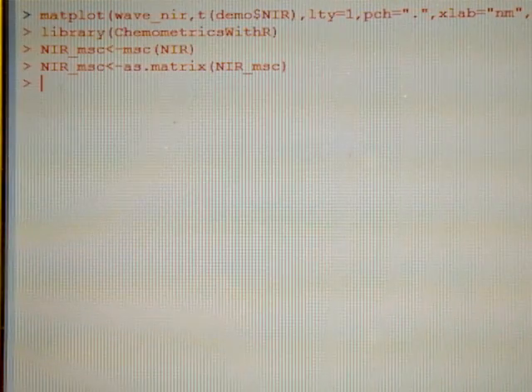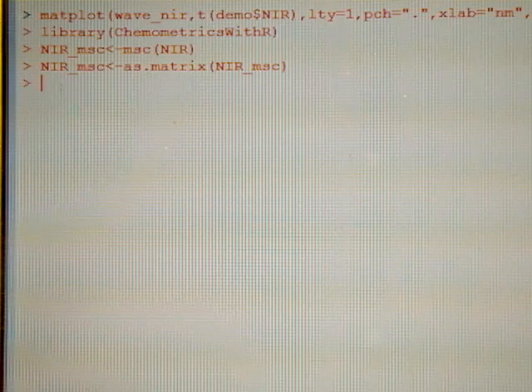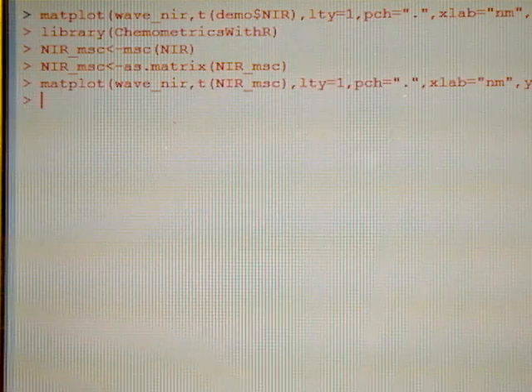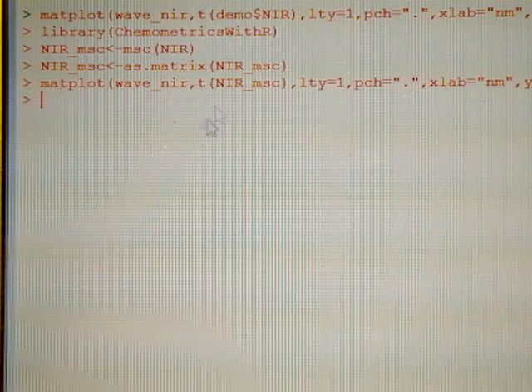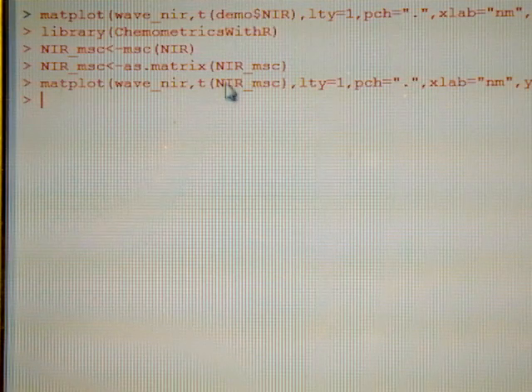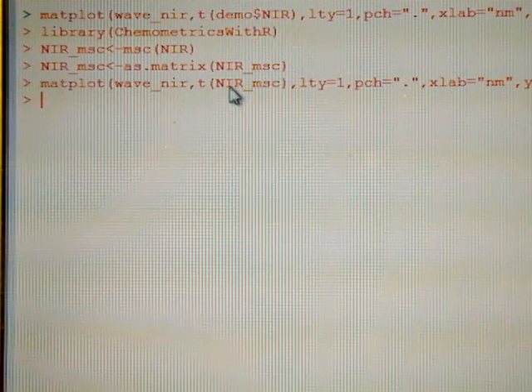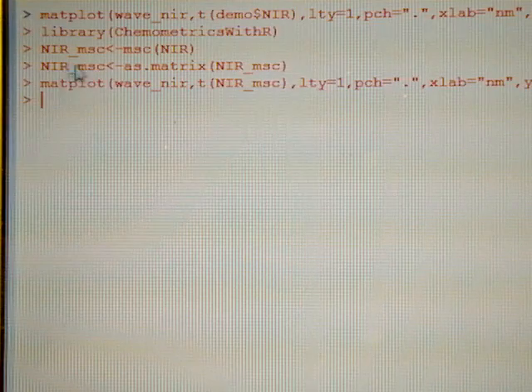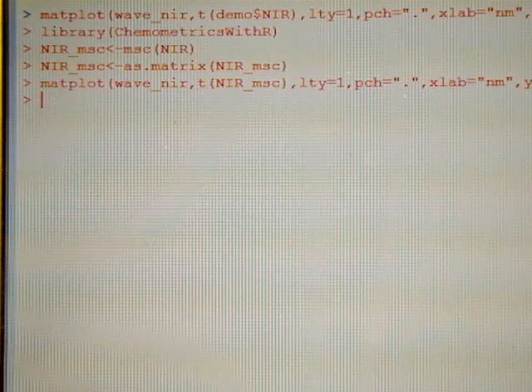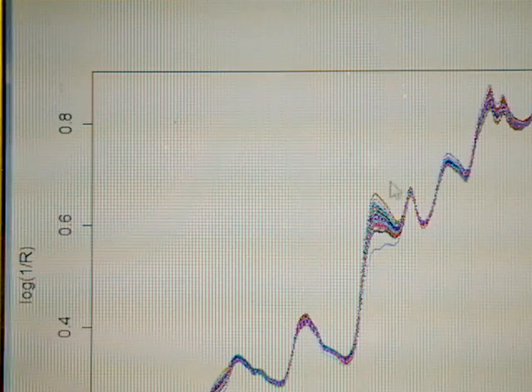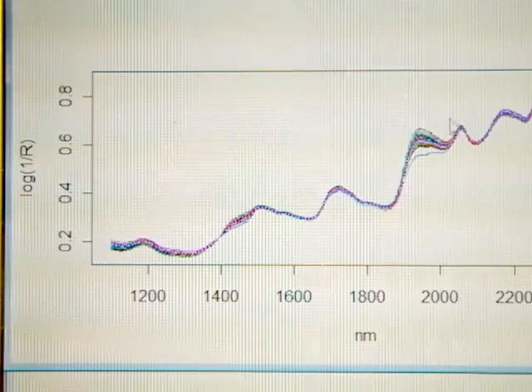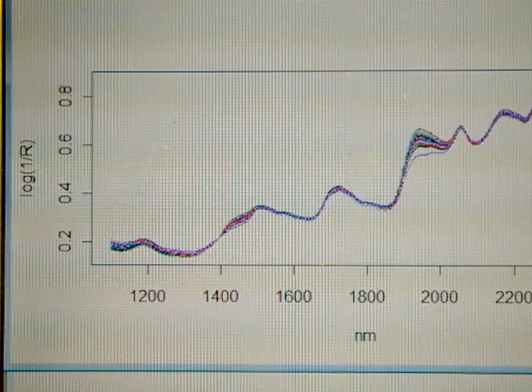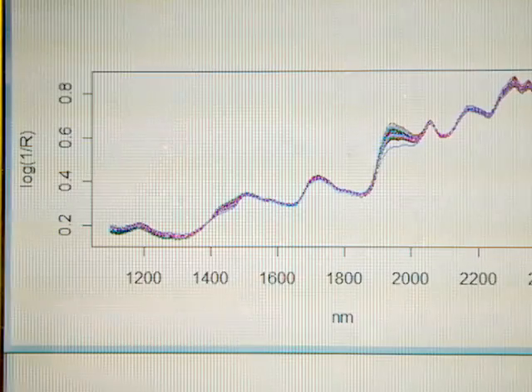And now we apply the command matplot, and we see that we changed this NIR for NIR MSC, the new treatment. And we have the results. Look now at the spectra, it looks much better.